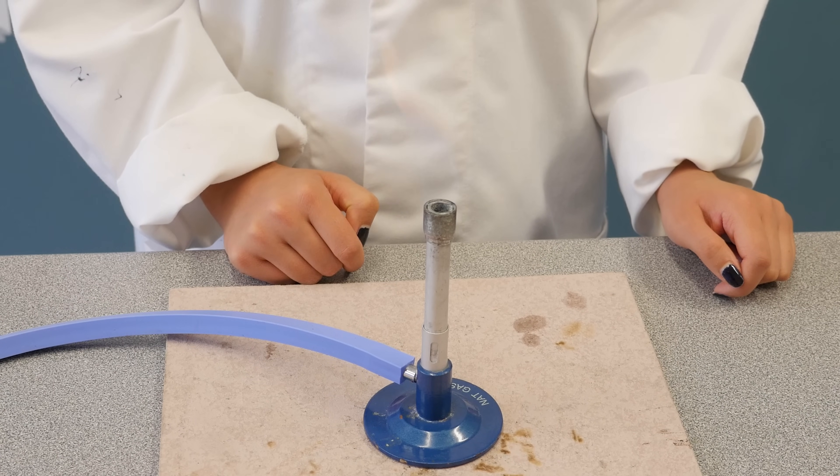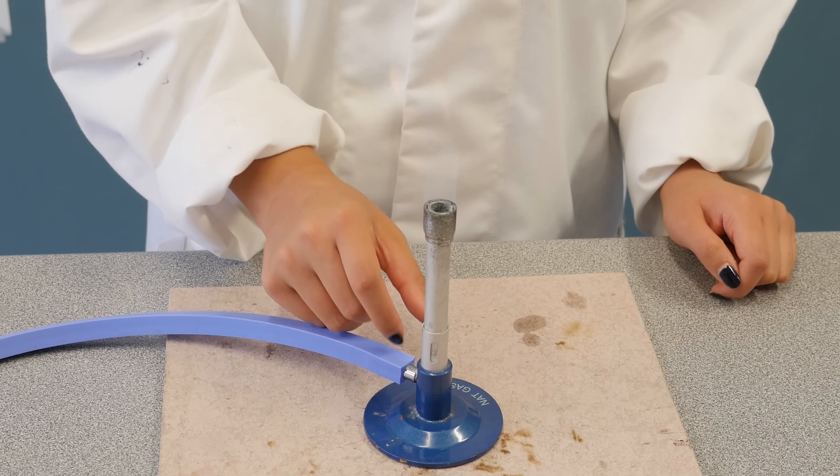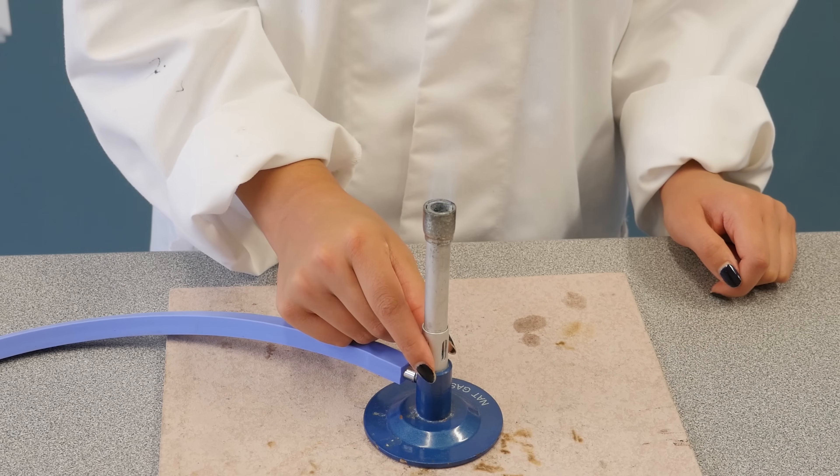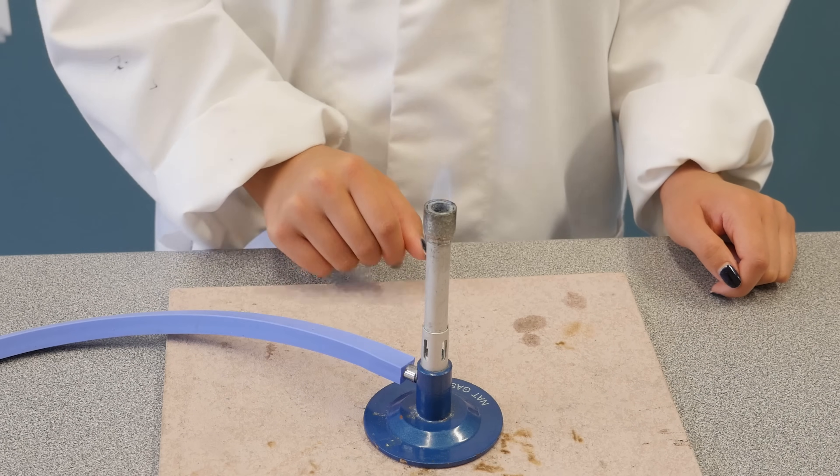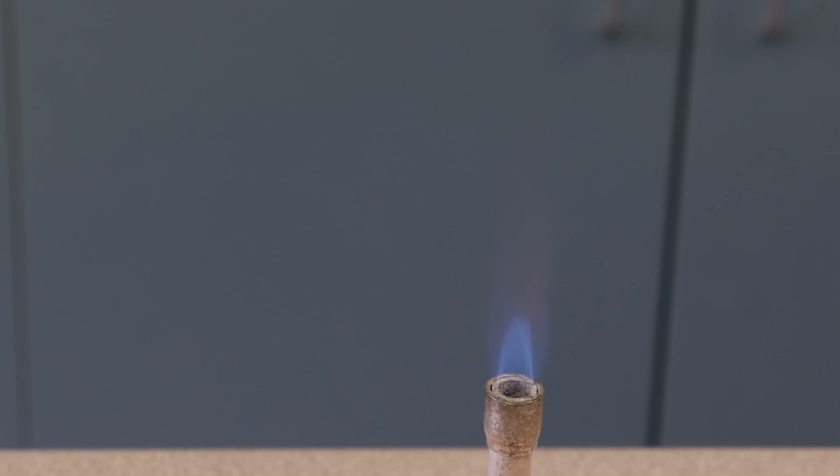To get a hotter flame, we need to mix in more air. To do this, turn the collar to open the air hole. You will now have a blue flame with a bright blue inner core. The hottest part of the blue flame is here, at the tip of the cone.